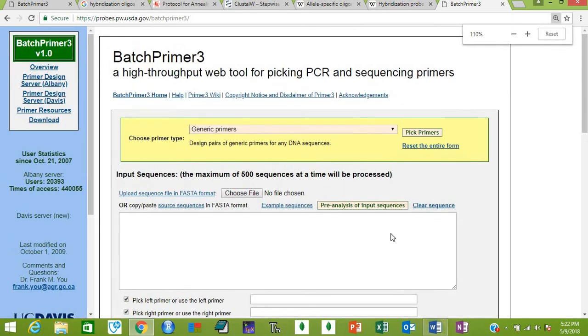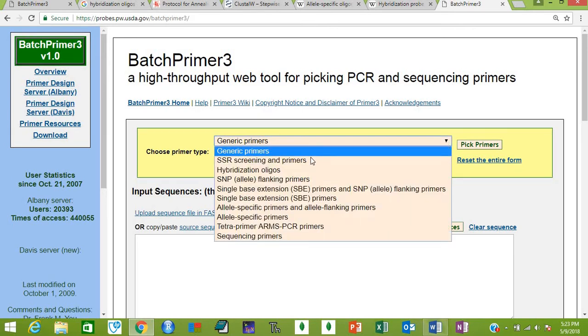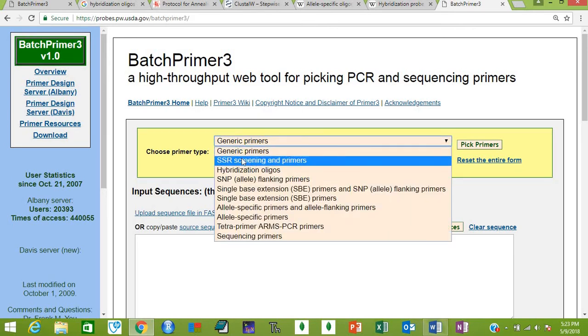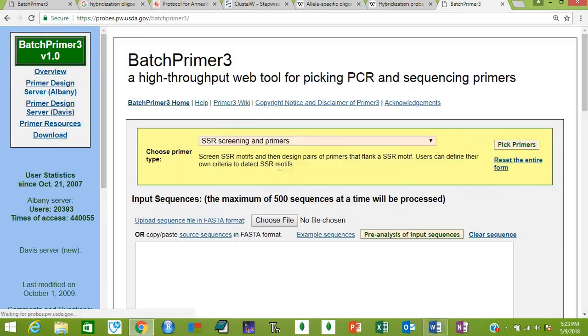Let me zoom it. Now you can see that here they have selected by default the generic primers, but I'm going to select SSR flanking primers. This is SSR screening and primers - it will screen the SSR as well as design primers for it.